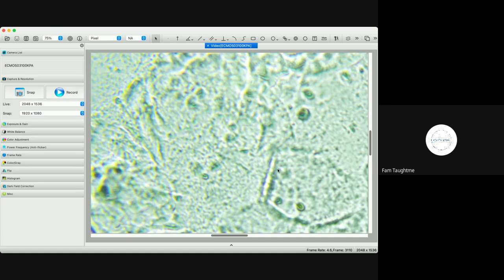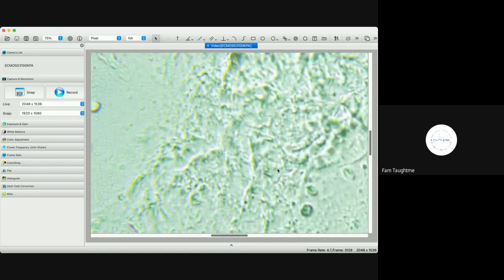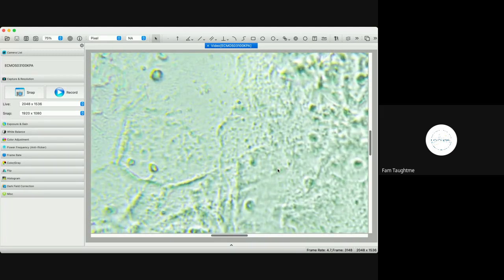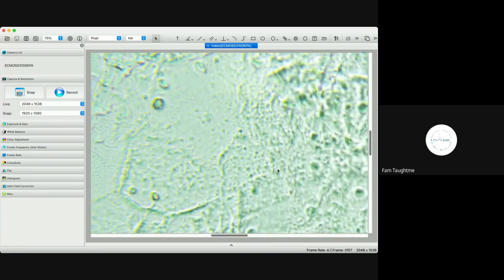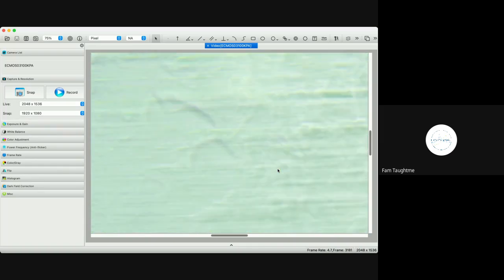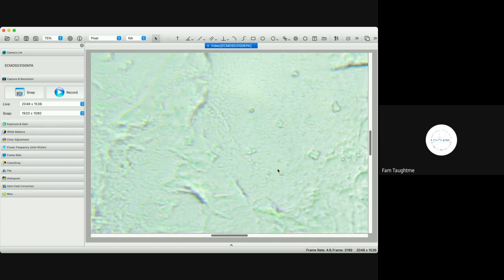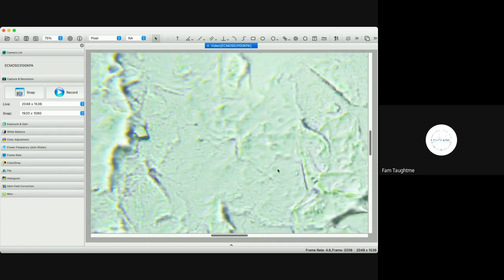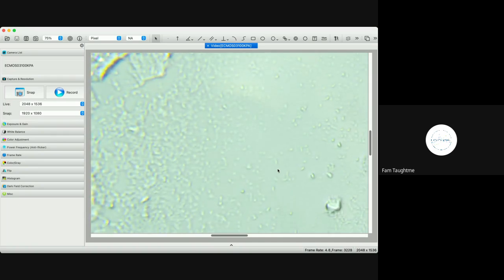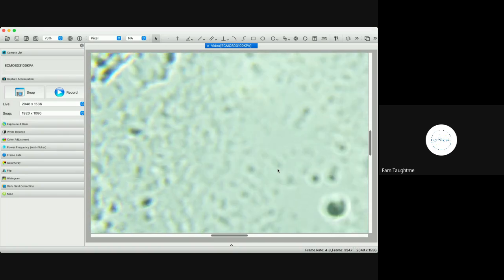And here, if you can see, there are different size little circular things. I saw these throughout too. Some of them were fluorescent green. Some of them were different sizes. I think those might be types of immune cells, like types of white blood cells, perhaps. And when I was menstruating, I also saw red blood cells, which look exactly like what they tell you it's going to look like. So that was cool to see my own cells like that.